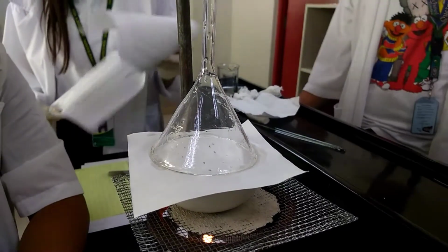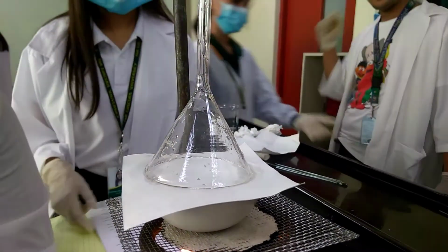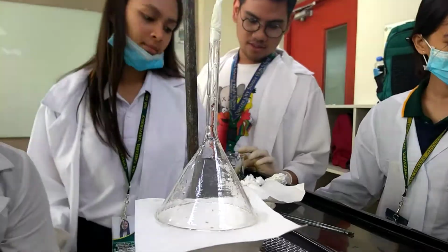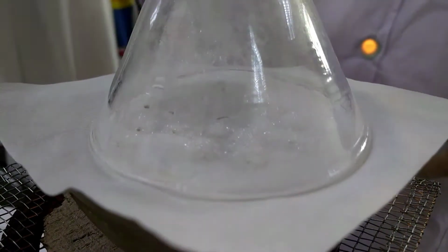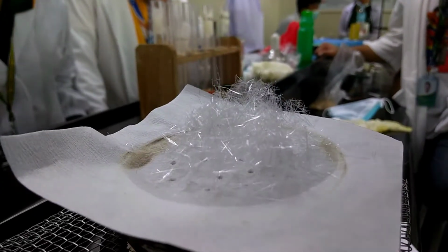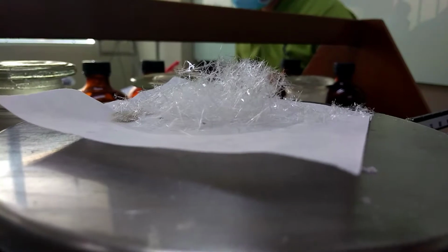Step 3. Place an inverted glass funnel on top of the evaporating dish. The tip of the funnel should be covered with packed moist tissue. Heat the evaporating dish gently until sublimation starts. Step 4. After heating and allowing all evaporation to take place, turn off the burner and cool the evaporating dish. Remove the funnel and collect the crystals that sublimated. Weigh the crystals and determine the percent recovery of the compound.